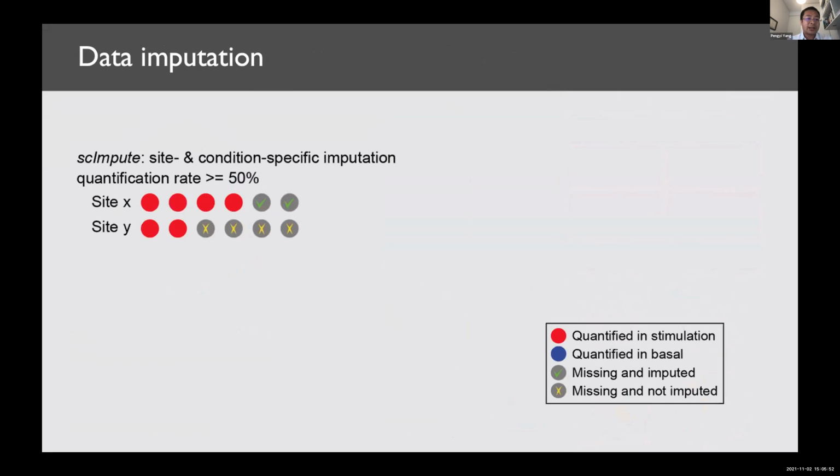And I want to start with imputation. Here we use a heuristic approach to implement different imputation functions. We will introduce a few of those imputation functions we implemented in PhosR. I will start with what we call site and condition specific imputation.